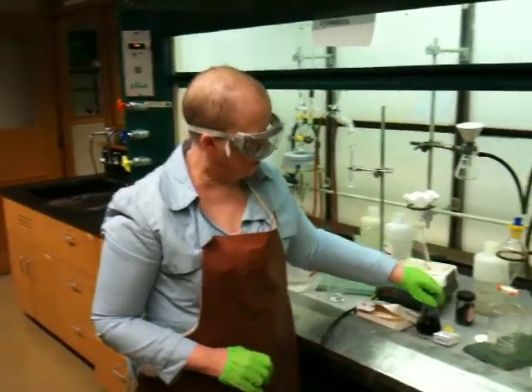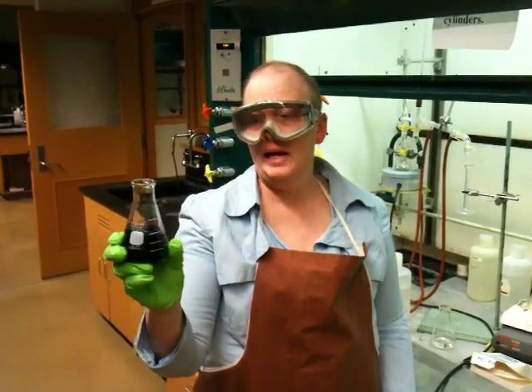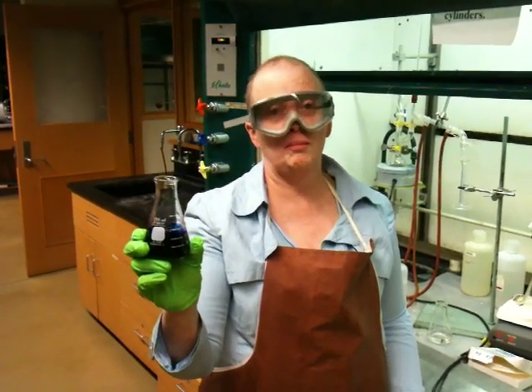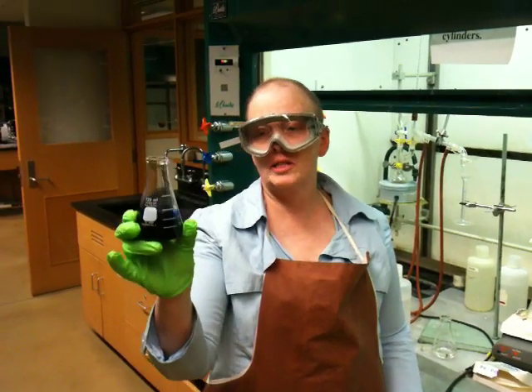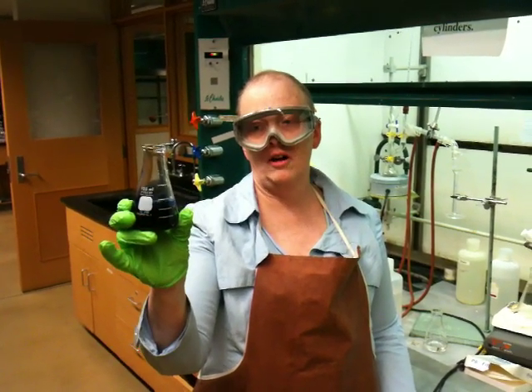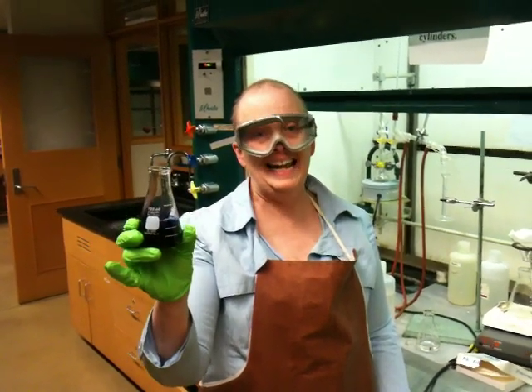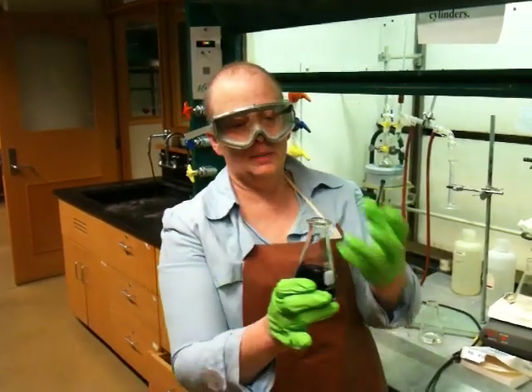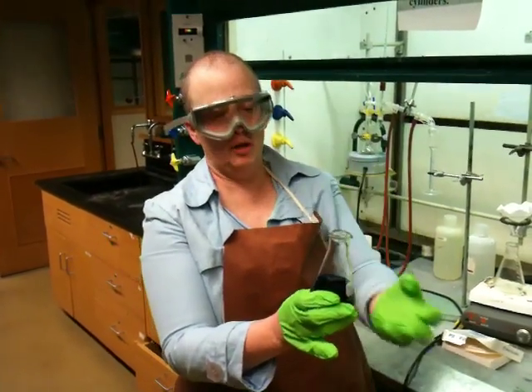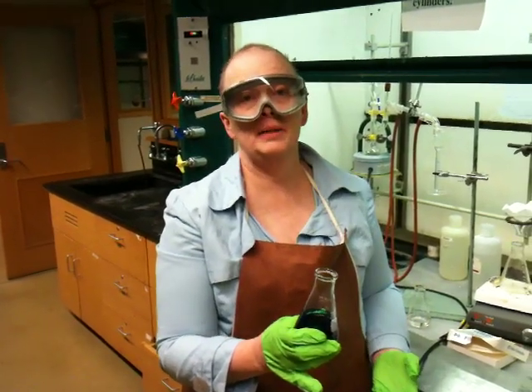So supposing I have a solution. This is an aqueous solution, and it has obviously a dark blue compound in it. Some organic compounds are actually colored. Most of the dyes that you encounter in your clothing are organic compounds. So this is a colored organic compound in an aqueous solution — that means it's in water. And what I want to do is pull this blue compound out of this water, because there might be other contaminants in it that I want it to get away from.